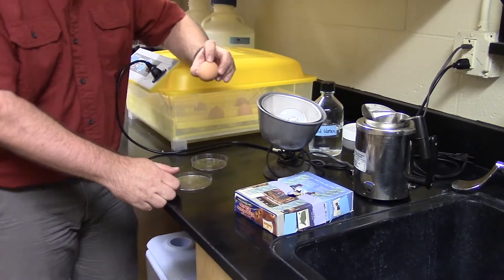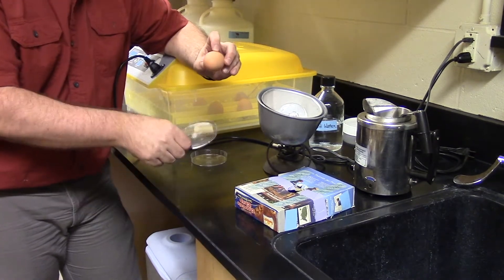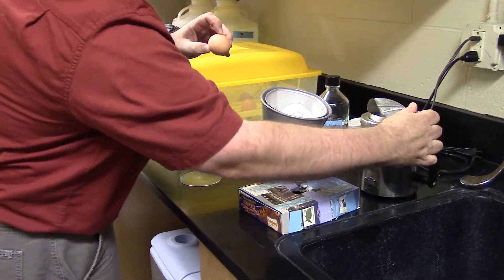The next part of this experiment, after we've located the embryo inside the egg, is to attach it firmly to a petri dish so that we can move it to a microscope.